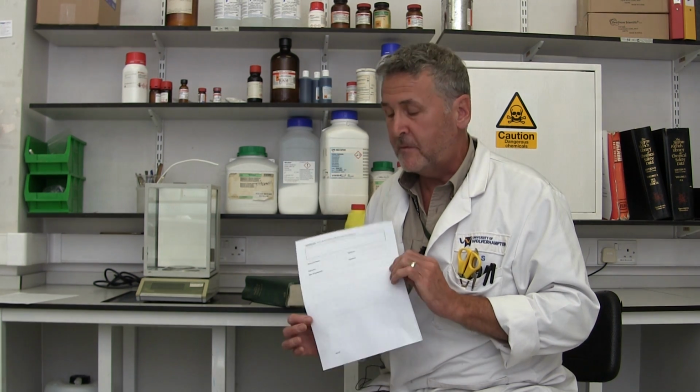And unless your answers are satisfactory, and unless you've done this CoSHH form to our satisfaction, we won't issue the substance. If we think you might come to harm because of what you're going to do, and you haven't detailed it on here, you'll be sent away to do the form again.